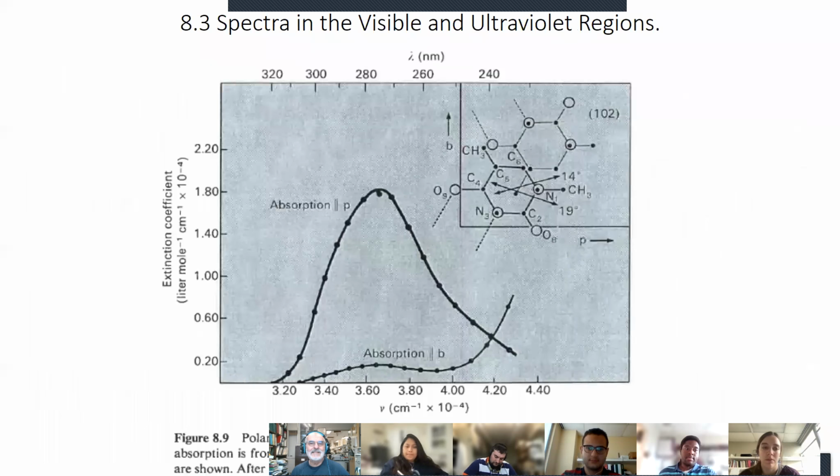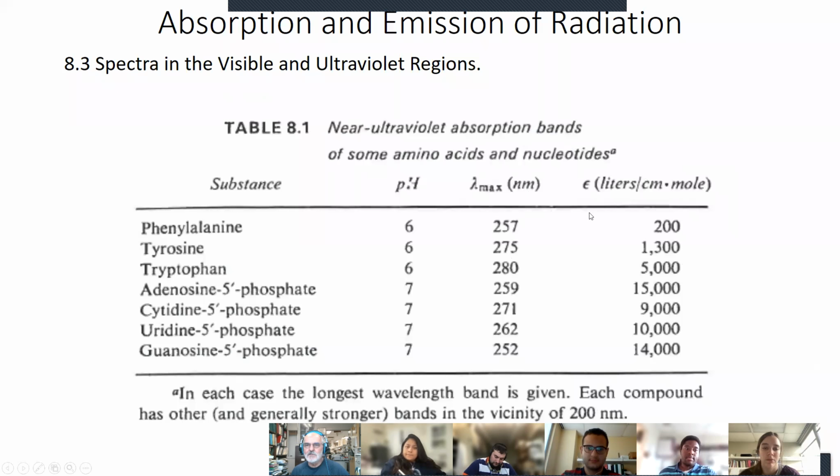Okay, so I stopped here because this table is telling you these are the spectroscopic characteristics of these amino acids. In principle, therefore, you can just sum up the sequence aromatics using these numbers. Notice these numbers, it was 5,500, it was 1450, and phenylalanine wasn't even listed because phenylalanine has a peak down around 250. So it has very little contribution to 280. And then the disulfides don't show up here, but those end up contributing a lot.